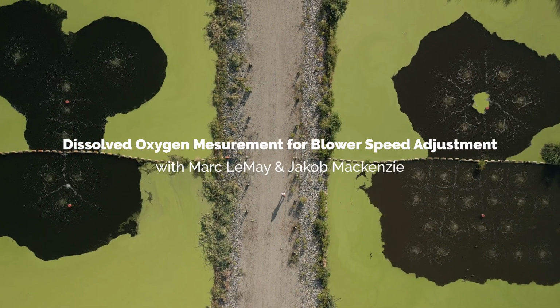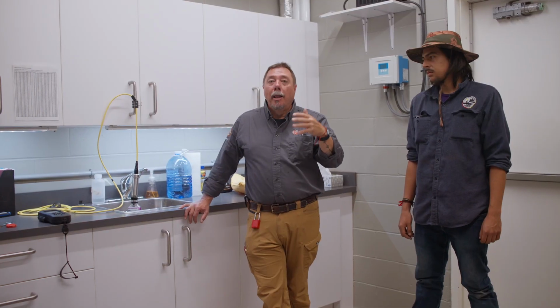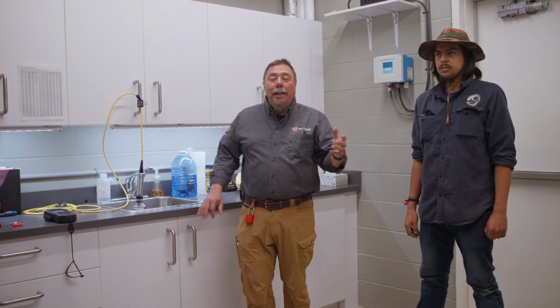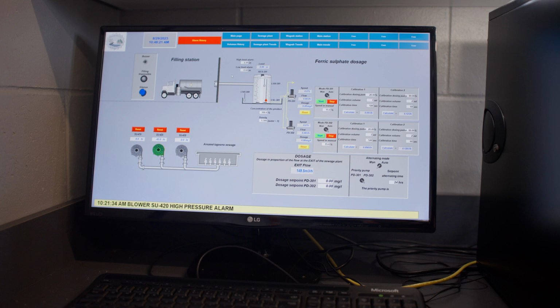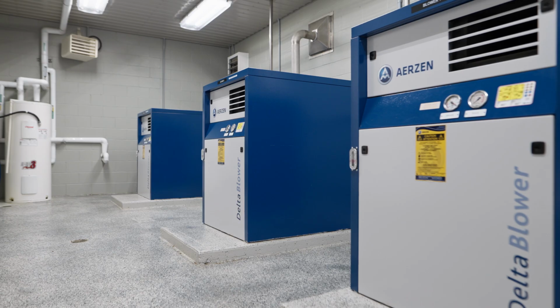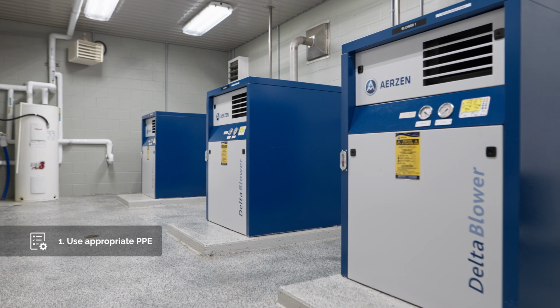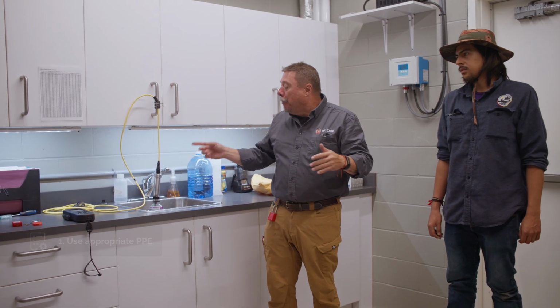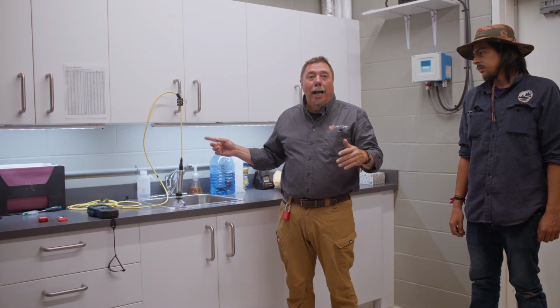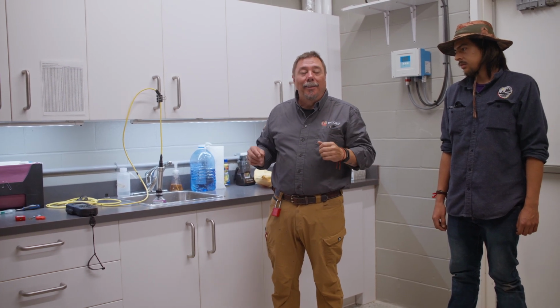So the role of the blower is to inject air into our lagoons. That's why they're called aerated lagoons, okay? Now to adjust the blower, because these blowers here are variable speed, we adjust how fast we want the blower to go, or whether we have to start another blower. To determine that, we have to take what we call the dissolved oxygen in the lagoons. This apparatus here is going to help us take the measurement of dissolved oxygen in the lagoons.